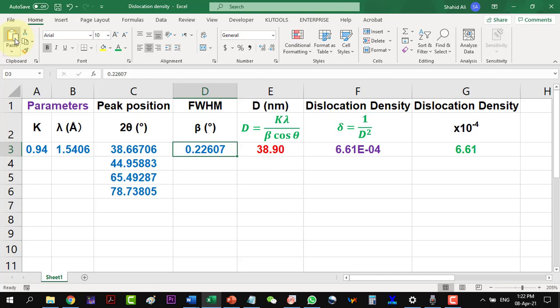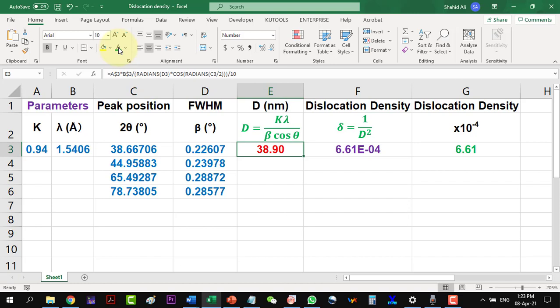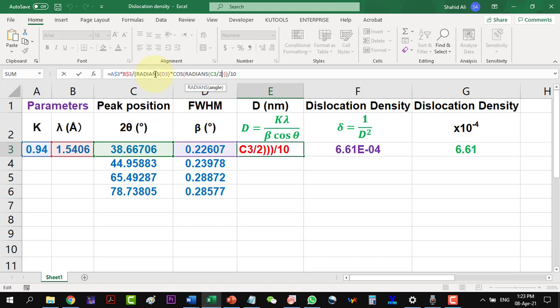Now we can calculate the crystallite size with the help of Scherrer equation. In this equation, I can see that K and lambda are being multiplied. I will have to convert the beta values in radians, which are in degrees by default.